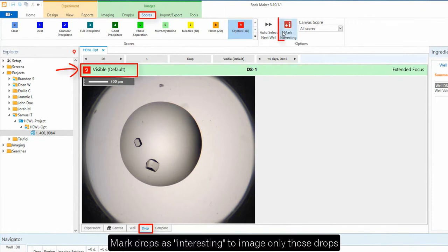You can also mark drops as interesting, which allows you to run an imaging session where only those drops are imaged.